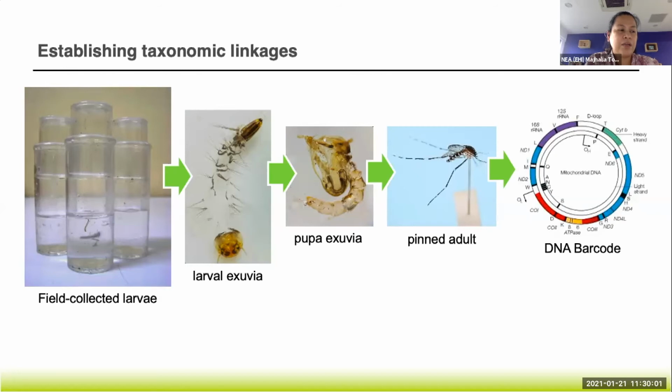Yes, actually, I will show you later that you can actually put your samples in alcohol, but don't use pure or 100% ethanol because this will dehydrate your samples. However, it is true that your larvae will also dilute your alcohol because when you transfer the larvae into your ethanol, you carry over some of the water from the habitat and then you dilute your ethanol with it.